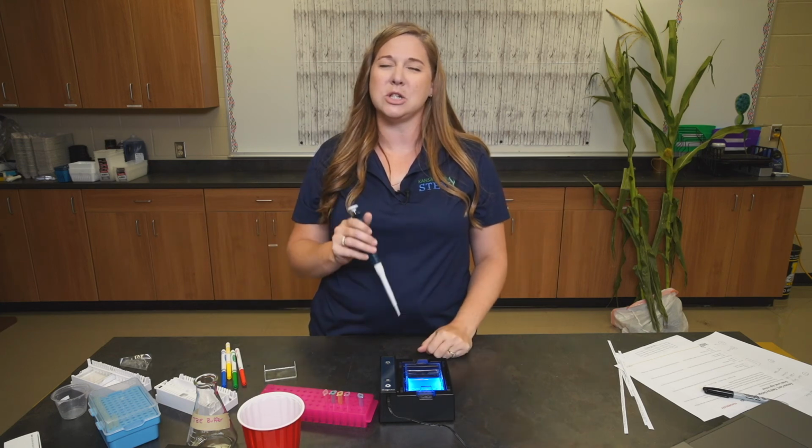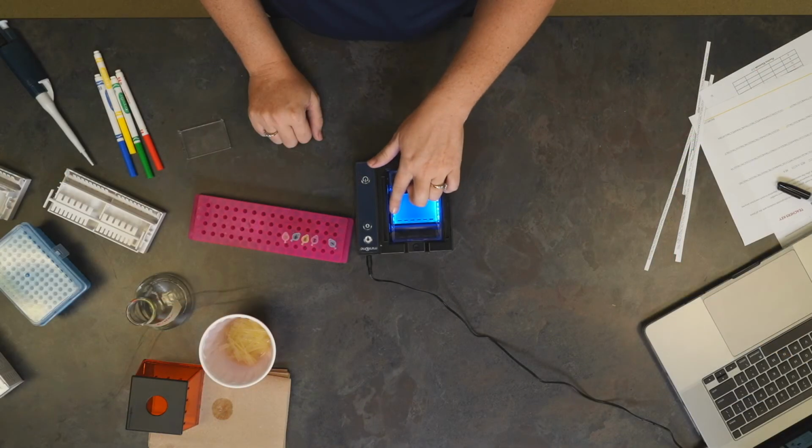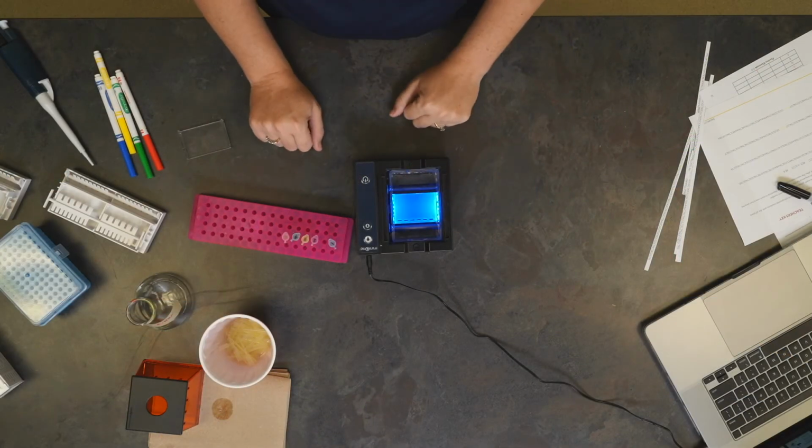Always encourage your students to take turns. Lab work isn't just for the few, it's for everyone. This is especially the fun part, so make sure that each student gets a chance to pipette. After you have all 5 samples loaded, you will be able to see the dark color in all of those wells. For today, we're just going to load the 1.